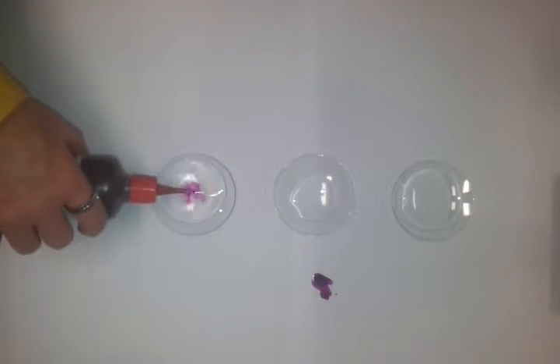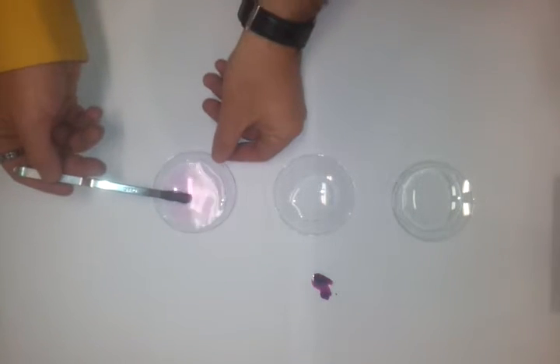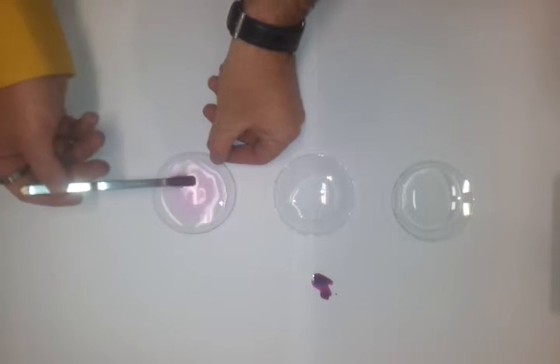So the one you should remember is when we add it to acidified solutions, and if redox occurs, then the permanganate solution will actually decolorize. And we can see there that that's not just diluting, that's actually decolorizing.